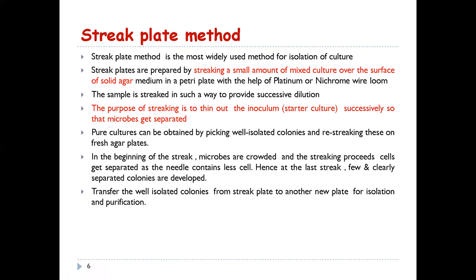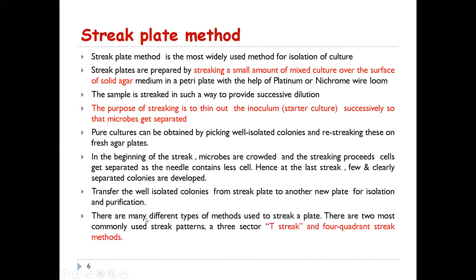Transfer the well-isolated colonies from the streak plate to another new plate for isolation and purification of the desired bacteria. There are many different types of streaking methods, and of these the three-sector or T-streak and four-quadrant streak are the most commonly used methods. In this practical we are going to see both of these methods.